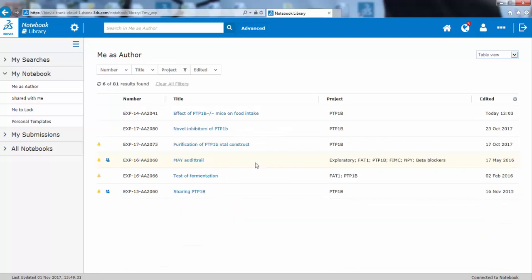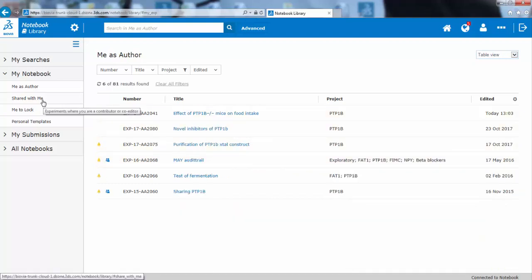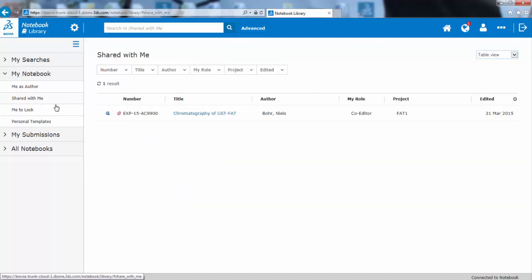You can also go to experiments which have been shared with you. This was not possible to identify in the Windows client, but is now easy to do. You can also navigate to your personal templates.